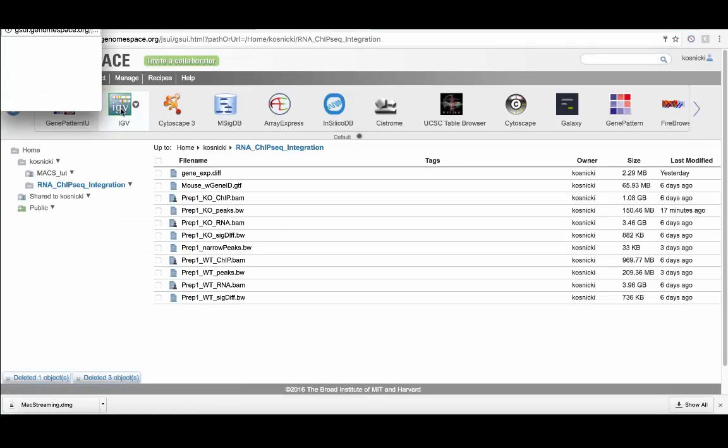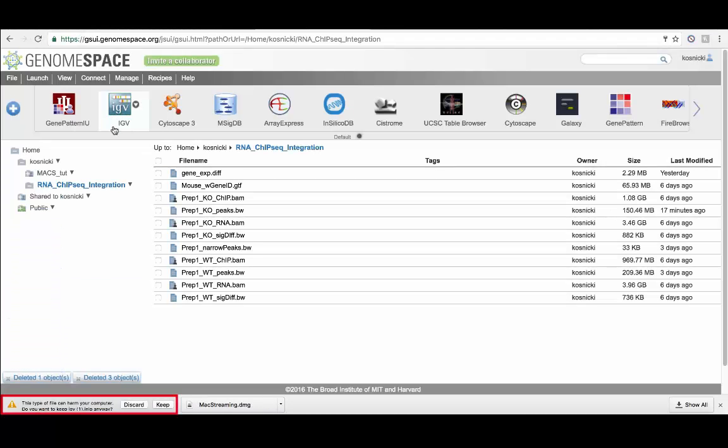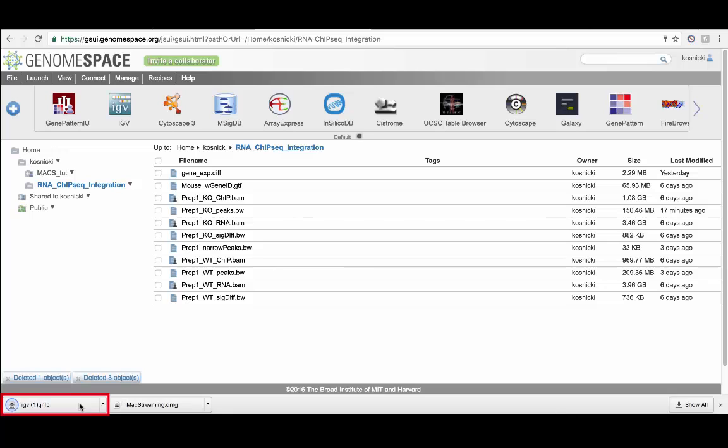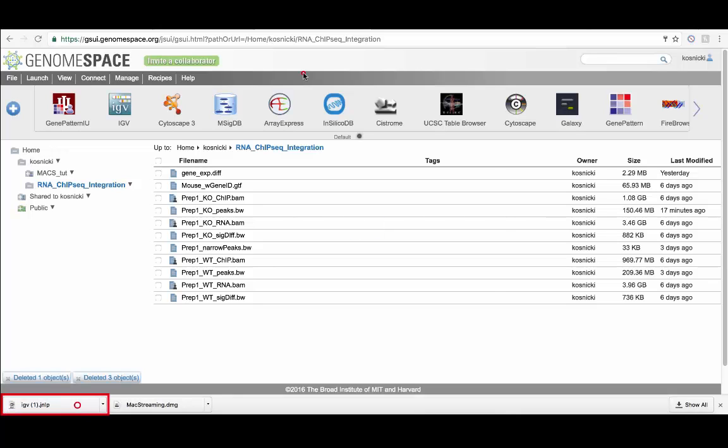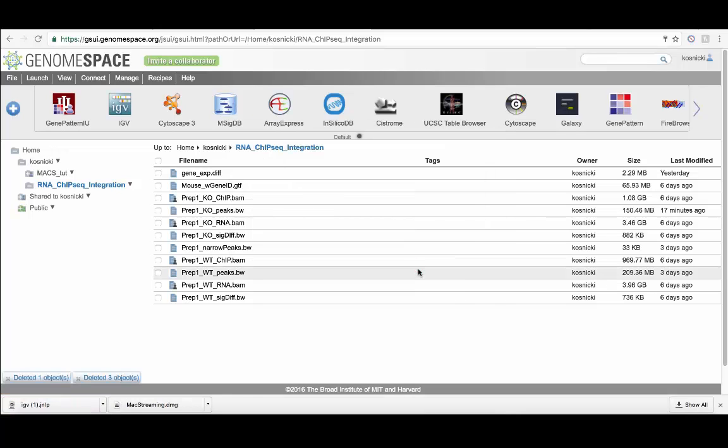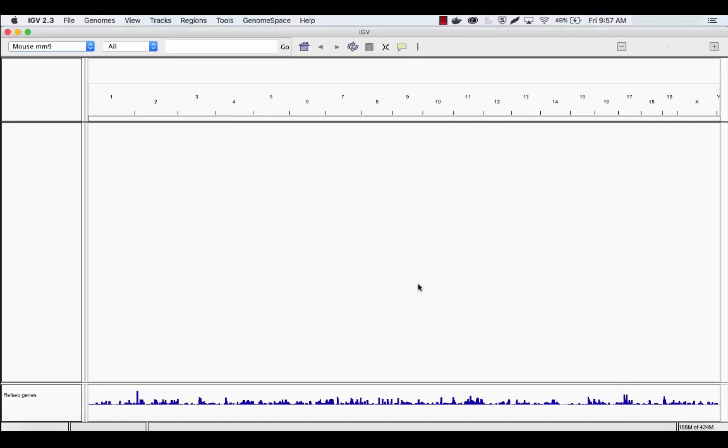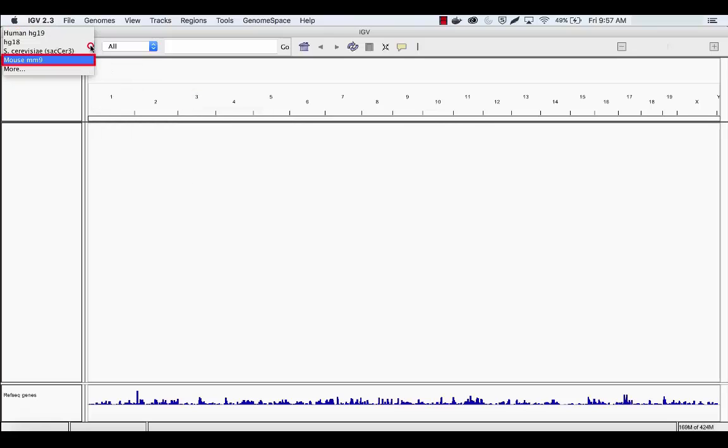Launch IGV in the GenomeSpace UI. When this instance of IGV has downloaded, double-click. Then select Run on the pop-up menu. If it isn't already selected, be sure to select the mouse MM9 Reference Genome.